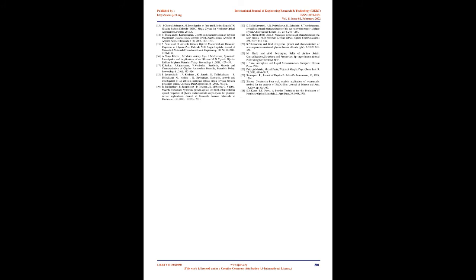This high band gap value indicates that the grown crystal possesses dielectric behavior to induce polarization when powerful radiation is incident on the material. The extinction coefficient of the crystal can be calculated by Swanepoel's equation. The extinction coefficient describes the loss of wave energy to the material 26, 27. The graph of extinction coefficient versus energy shows an exponential decay.